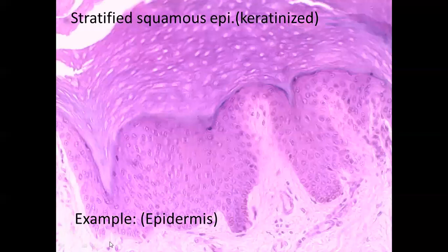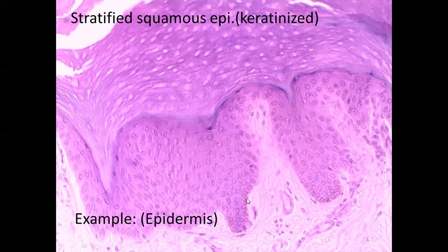This is also stratified squamous epithelium, high power of the stratified squamous epithelium, keratinized, taken from the epidermis. This layer is the stratum basale, then stratum spinosum.